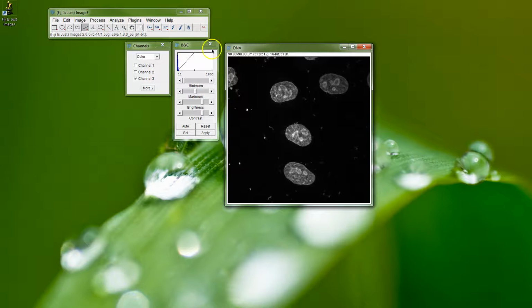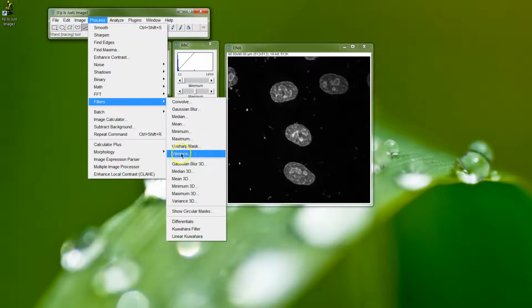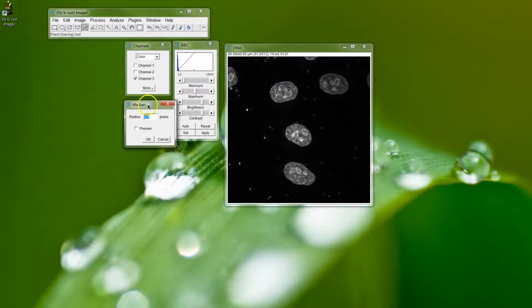I'm going to smooth the layer out a bit, and that's why I duplicate, so you can do a little bit of smoothing. You may not need this, but if you go to median, for example, you can get a preview and you can see what it looks like when you smooth it out. We can do 2, even more, just an extreme case to show 5, and you can still see the outline, but it's a much cleaner outline, and so you can use these smoothing factors to get rid of these things. Too much, you start to change the information, but a small amount, a couple of pixels, is fine.